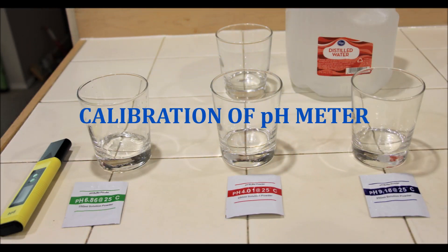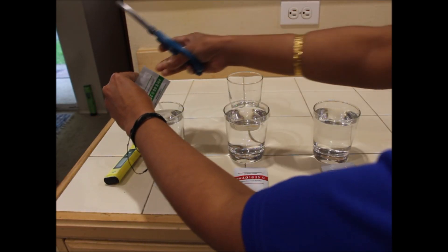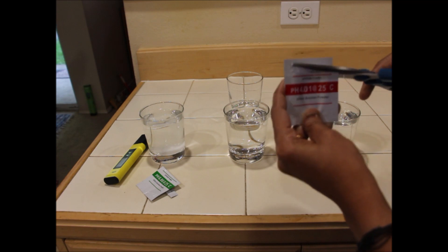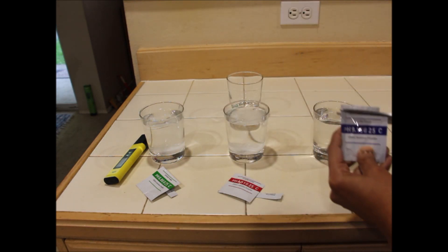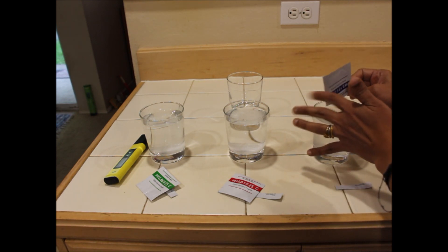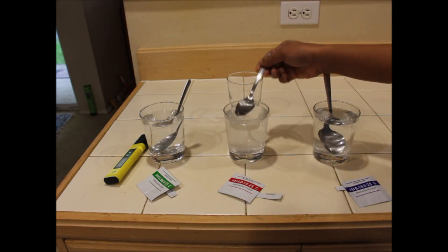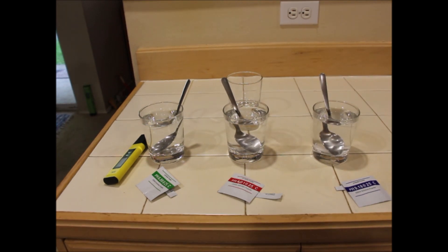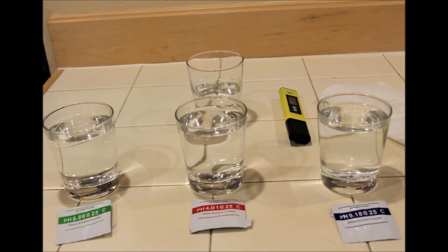This pH meter needs to be calibrated so that it can provide accurate results when we start using it for testing. When you buy a pH meter, you get three solution powders along with the pack — one is neutral with a green label, one is acidic with a red label, and one is basic with a blue label. Take 250 ml of distilled water in three different cups and add these solution powders in each of them. Mix thoroughly so that all the powder is completely dissolved, using three different spoons to avoid cross-contamination. Then take half a cup of distilled water in another glass — this is used to cleanse the pH meter after you immerse it in each solution to ensure accurate results.